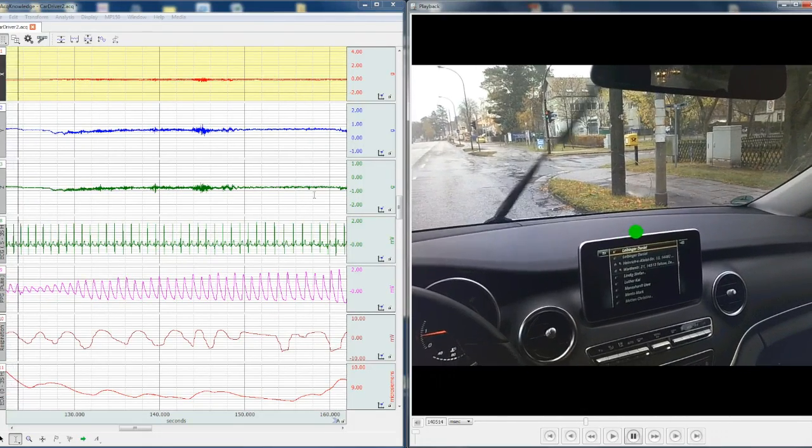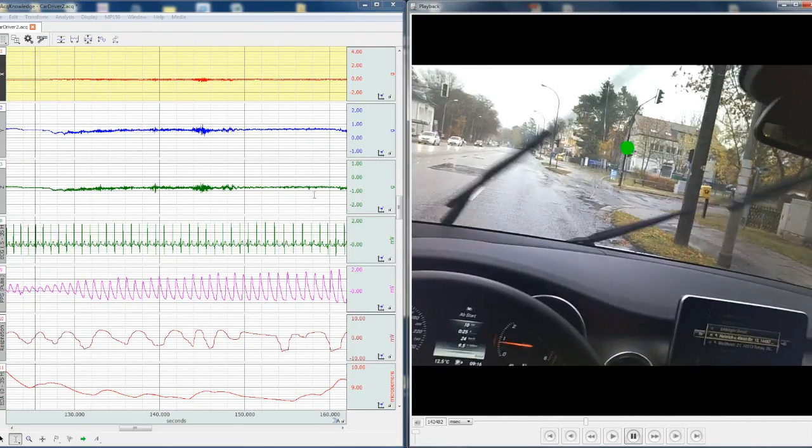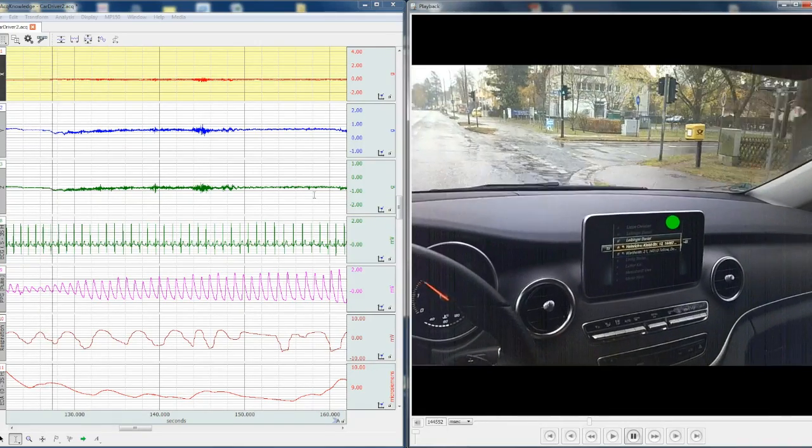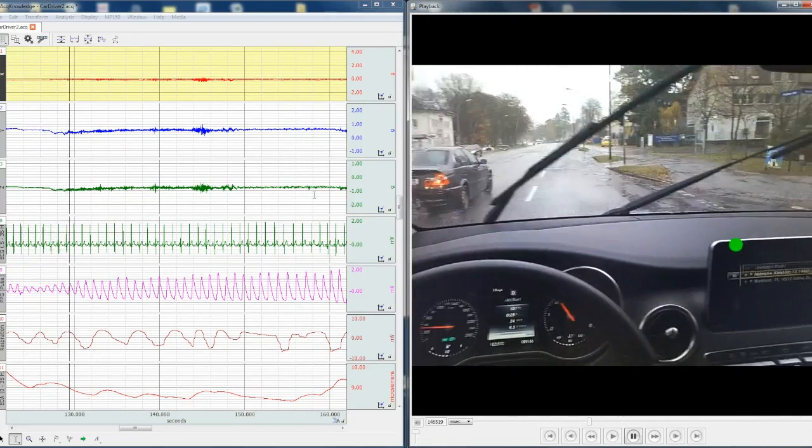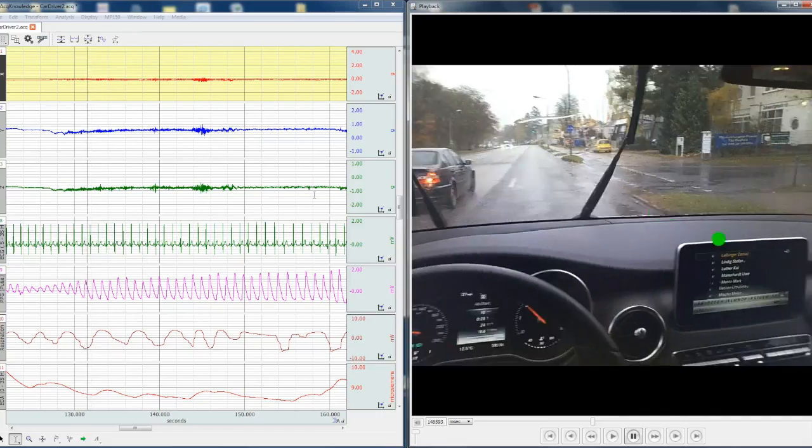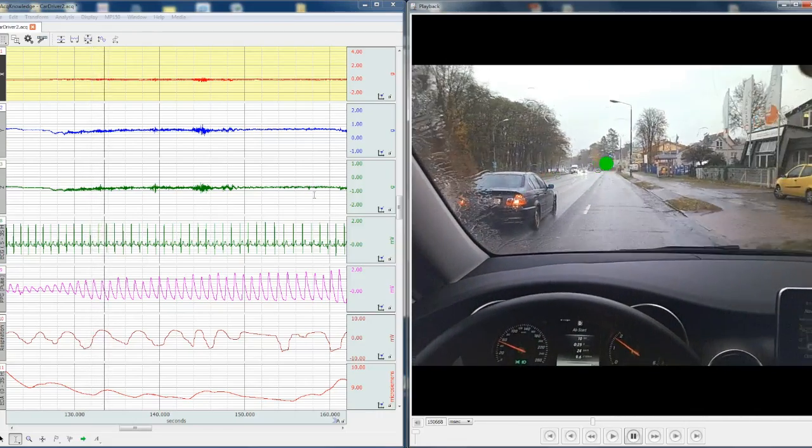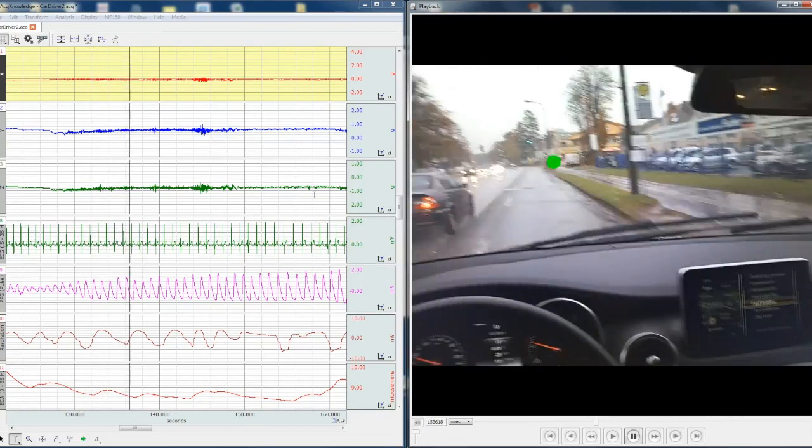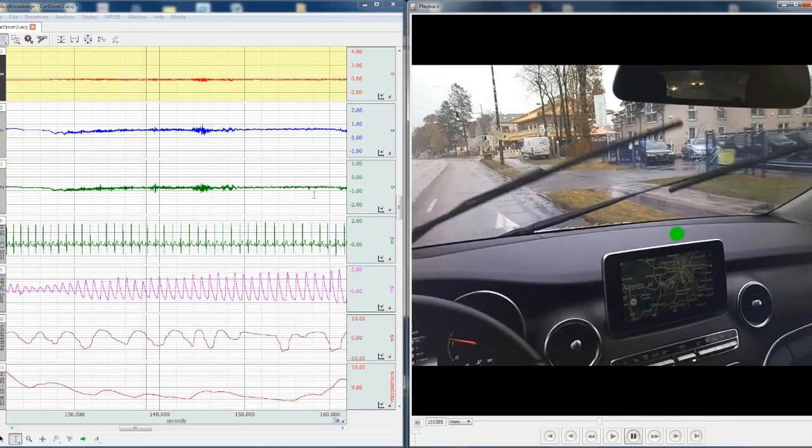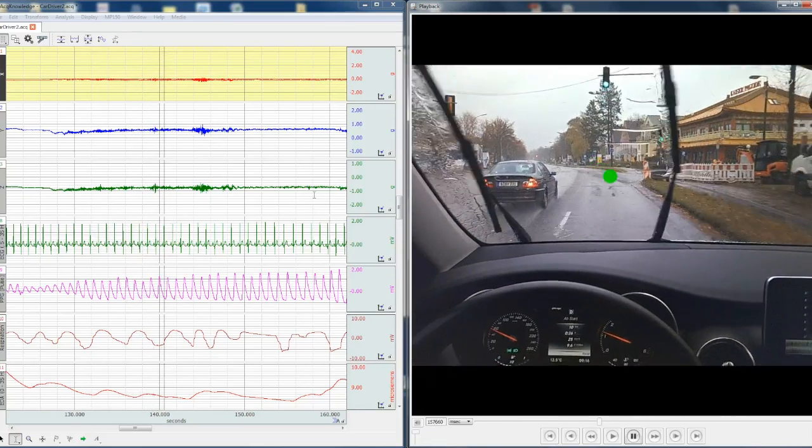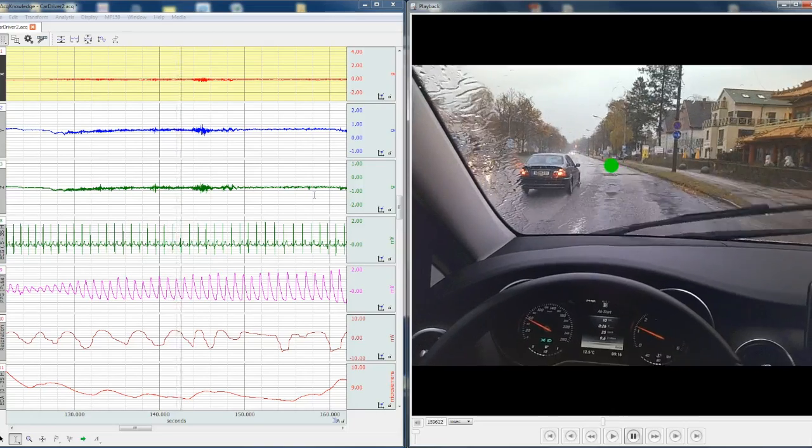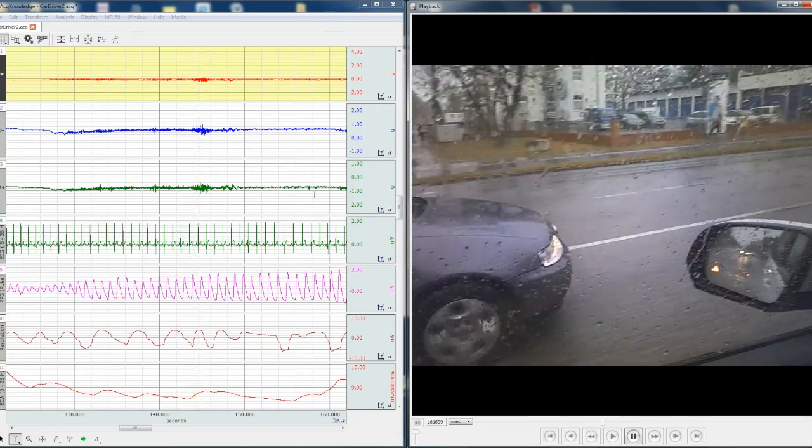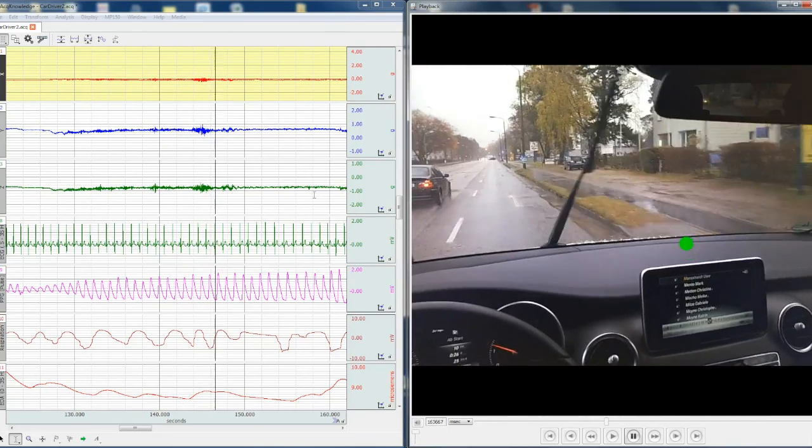tasks in the vehicle and monitoring to see how those particular tasks impacts the physiological response. So that concludes the demonstration of the acknowledge software media functionality with the SMI glasses and the bio nomadics data logger.